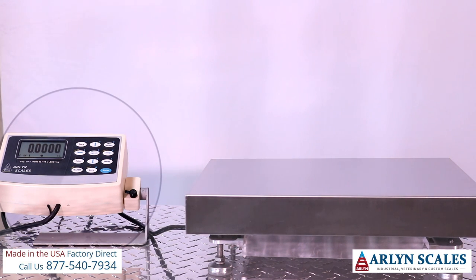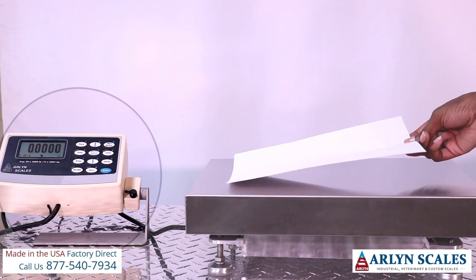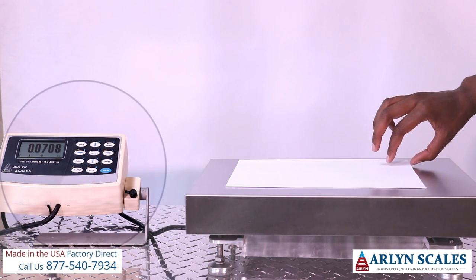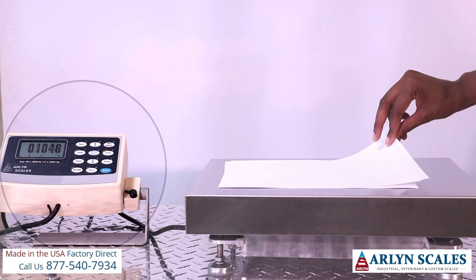So now we are just going to weigh a few sheets of paper and then we are going to remove one to show that it registers the missing piece. Voila!